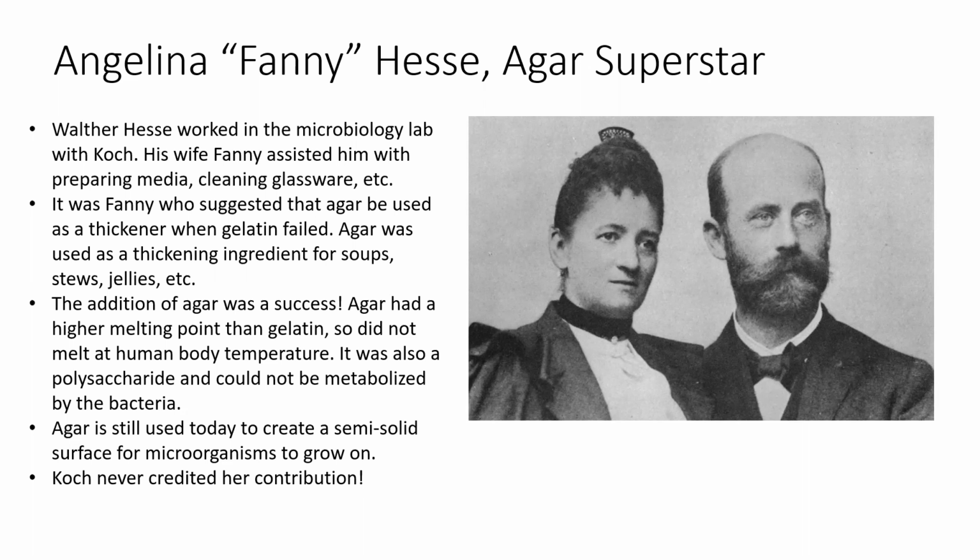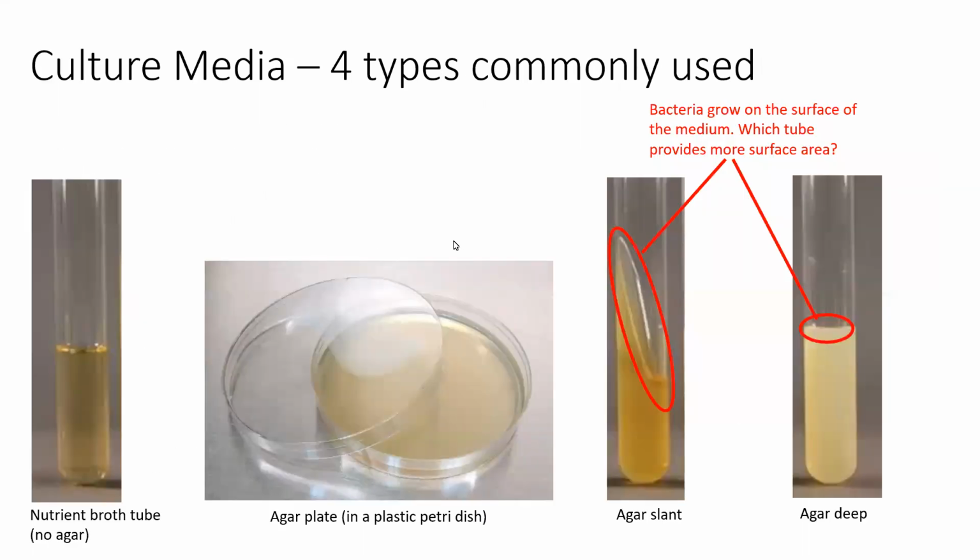But y'all, agar has another really, really helpful property, and that is that it is a solid at like room temperature, which is when we're working with it. But at really high temperatures, it's a liquid. And so this allows us to essentially create the different media that you see here, but specifically the solid media, the right three images, because agar is simply a solidifying agent. That is it. Again, it is not a source of nutrition. It is just a solidifying agent.